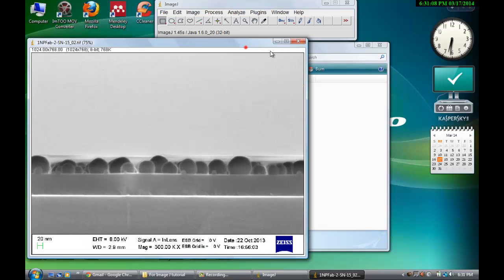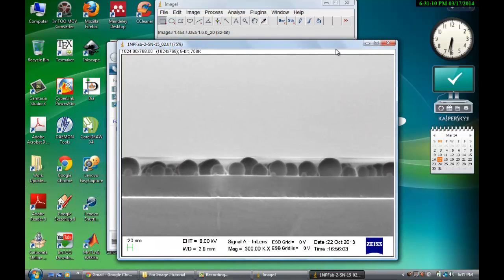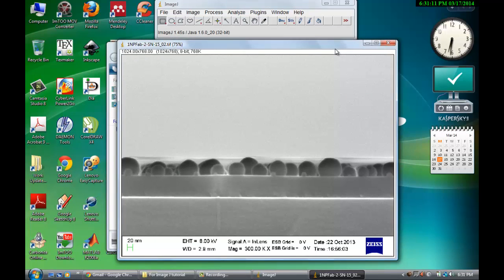Cancel this. So this is open in the ImageJ interface.